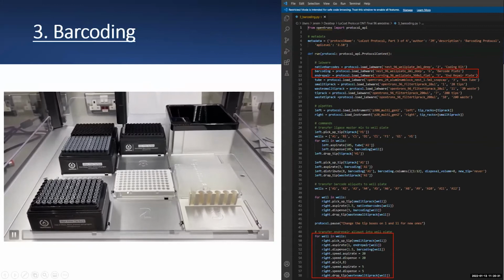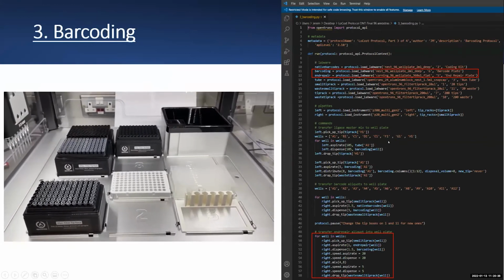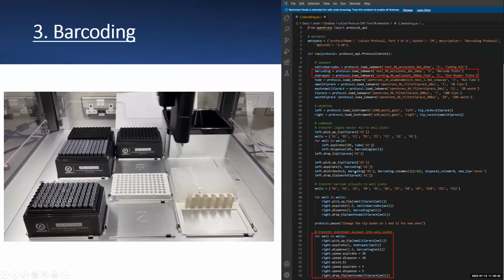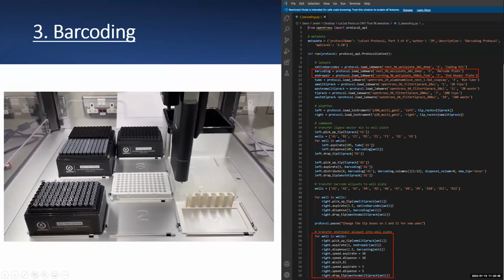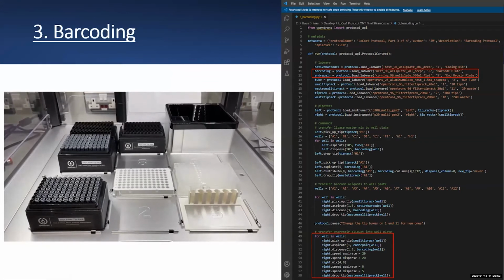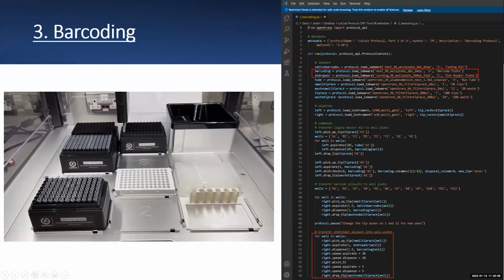However, if you want, for example, a lot more precise and accurate pipetting, which especially may be the case if you've got a requirement of only transferring, say, 1 microliter or even less than that, then by calibrating these individually, you can maintain accurate pipetting.